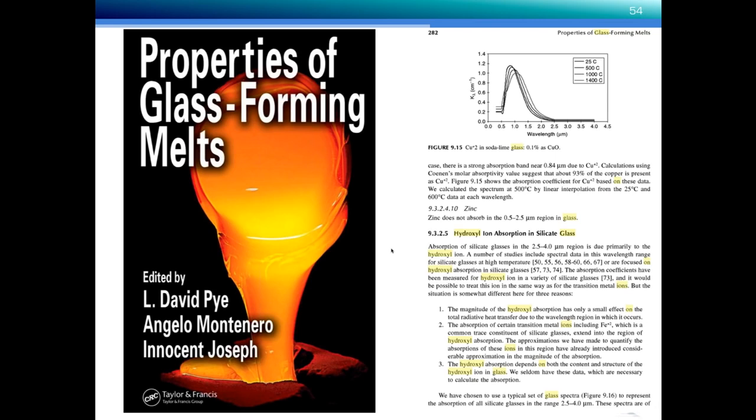There's a video we have online for how to replace the dry-rite. If you still have a little bit of blue in your dry-rite canister, you're good to go. Don't worry about it. But if it's all pink or all lavender, it's saturated with moisture, and you're going to run into some variability. Maybe not as much as if your filament's not aligned over your air jet, or your glass isn't perfectly aligned within the filament, but it will introduce some issues if you have humidity in many cases.